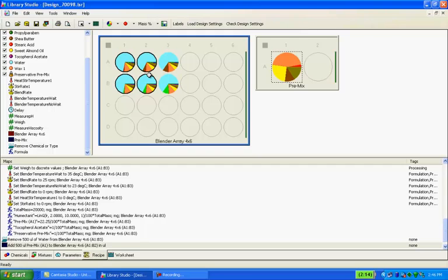And this is an example where you can prepare a premix. For this particular case, it's a wax formulation which you basically pre-made, and then you can dispense from that plate to your actual formulation plate by many-to-many mapping.